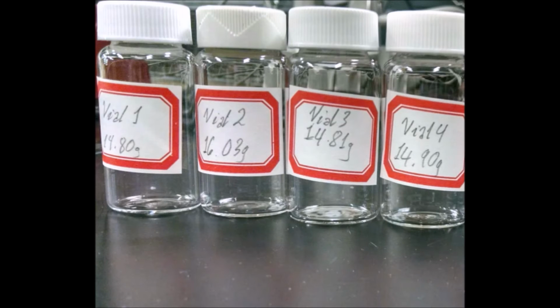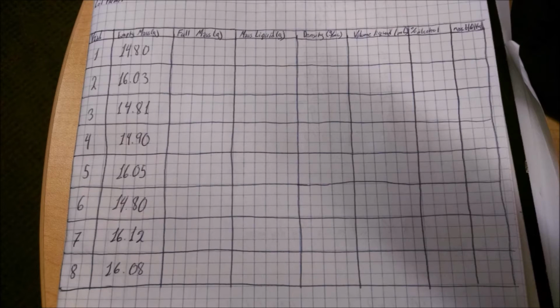Using the scale, mass 4 separate vials. Label them with their mass and the numbers 1 through 4. It is very important that each vial remains with its own cap. To record your results, create a chart like this.